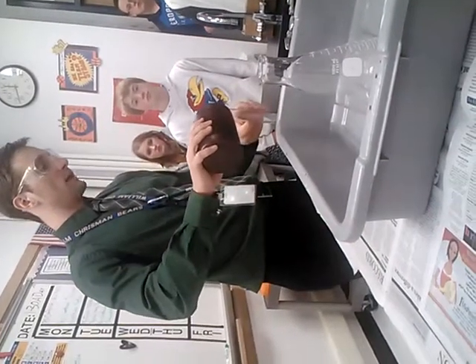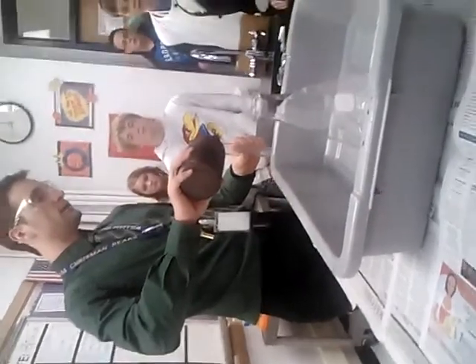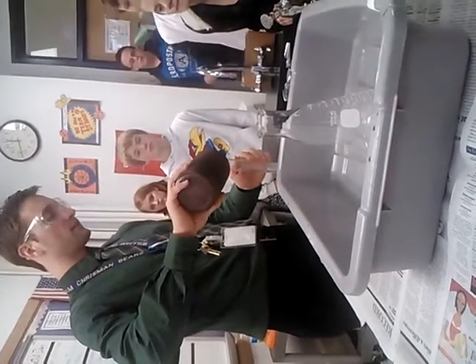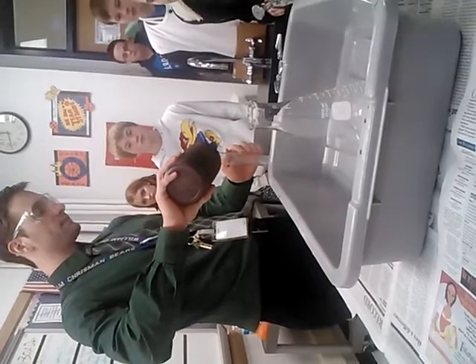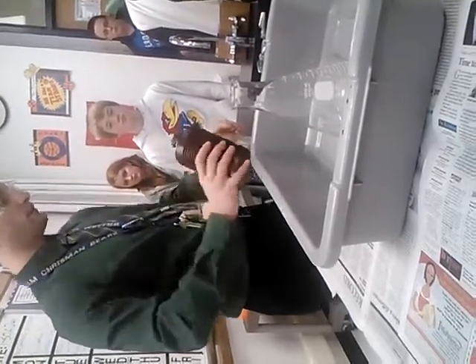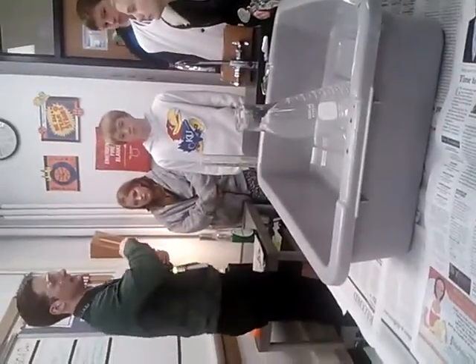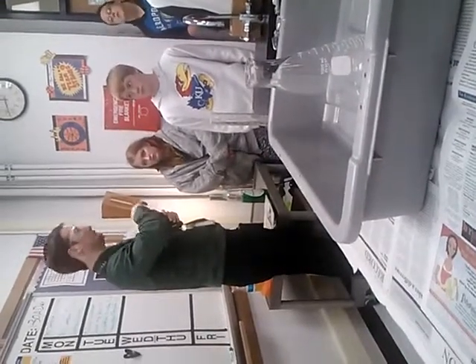Well, the stuff you buy at the drugstore, like CVS, is 3%. This is 30%. So this is much stronger. If I was to just get this on my skin, then it would bubble. If I was to get this in my eyes, that would be a huge deal. So I'm going to go ahead and wear goggles since I'm handling it. We're going to put about 40 milliliters in. There we go. So this is some pretty potent stuff. If you were to put 30% hydrogen peroxide into a cut, it would absolutely burn.